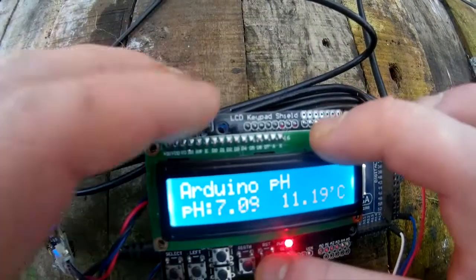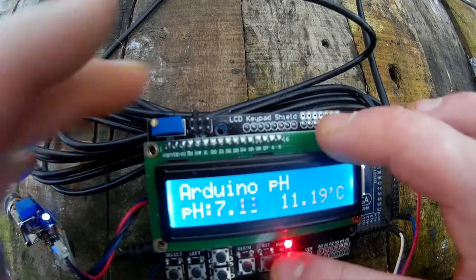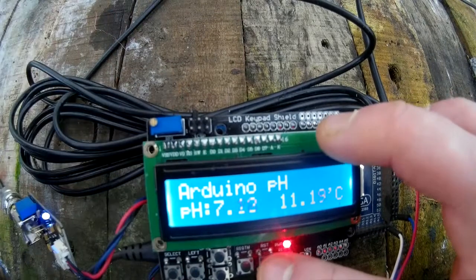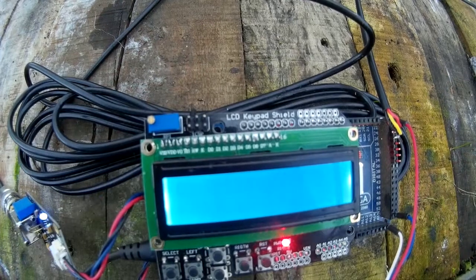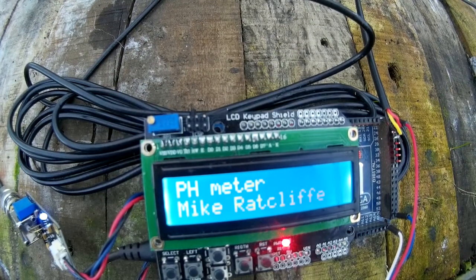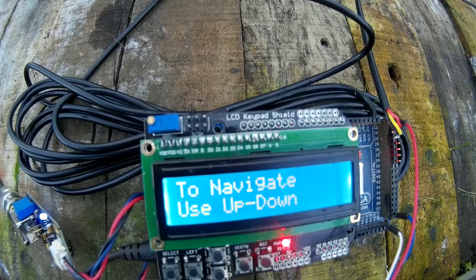Reboot your Arduino — you want to be powering this off a 12-volt power supply as well, because the USB is a little bit noisier. So if you click reset, the boot-up screen will tell you what it is, and it will tell you how to use the screen: up and down to navigate, and select to calibrate.